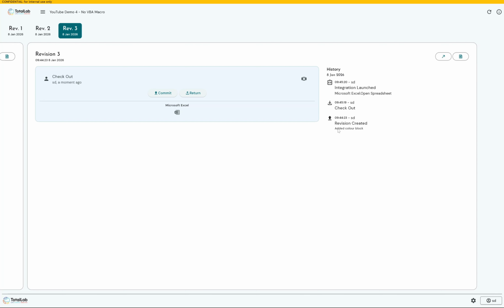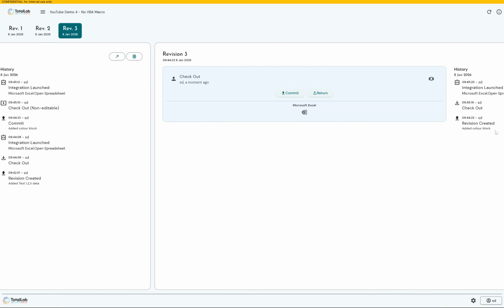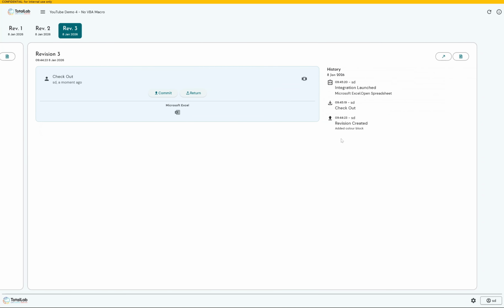You can use the notes section. You can write a paper-based SOP or a digital SOP around how users should use the notes section to add context, to add information about what they added, but we don't have that automatically, and that is the price that we pay for the security of not allowing VBA or macro usage, or not requiring it, shall we say.